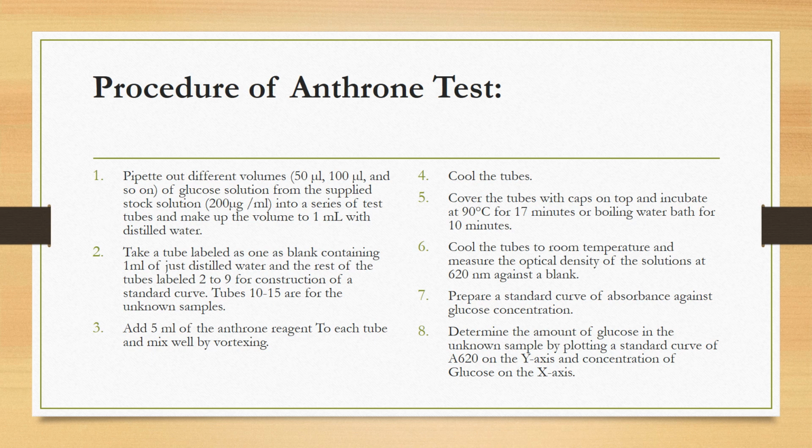The other tubes you make, you know the concentration of them from step number 1. We take different volumes, 50 microliter, 100 microliter, and so on.